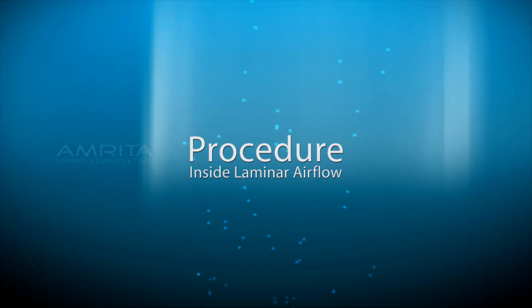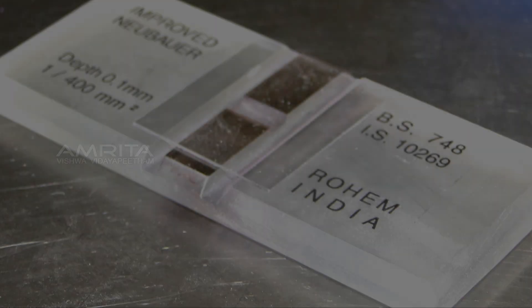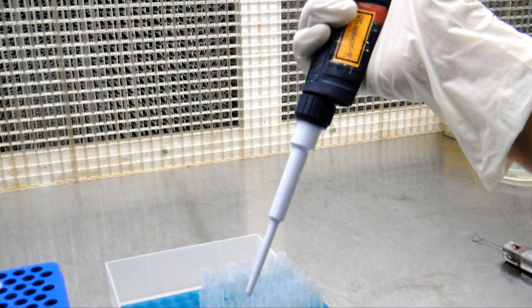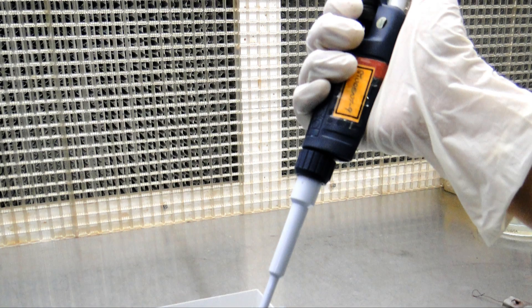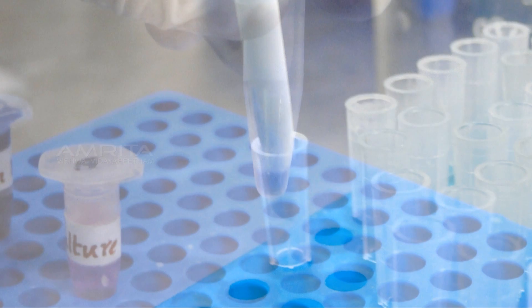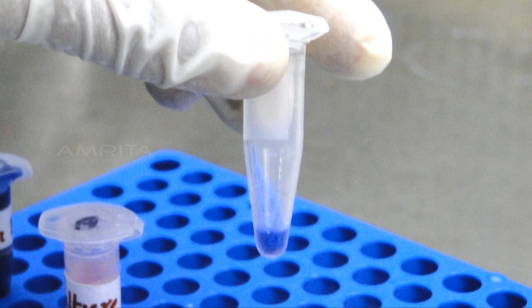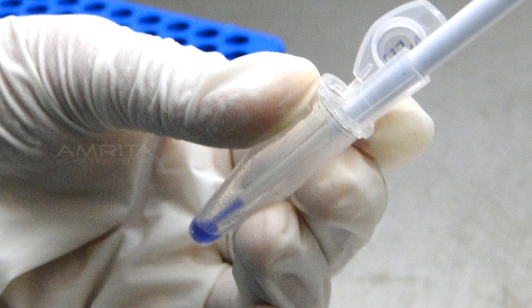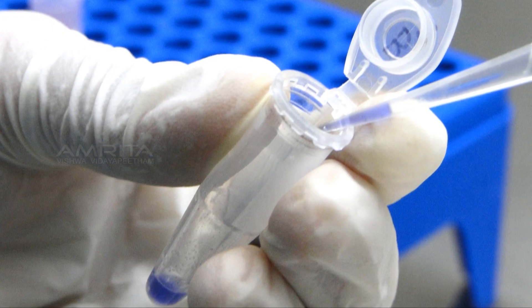Now procedure inside the laminar airflow. Take the hemocytometer and place it inside the laminar airflow. Set the scale of micro pipette to 10 microliters. Insert a new micro pipette tip. Take the vial containing trypan blue cell suspension, open it, and mix the suspension with micro pipette. Take 10 microliters of the cell suspension.